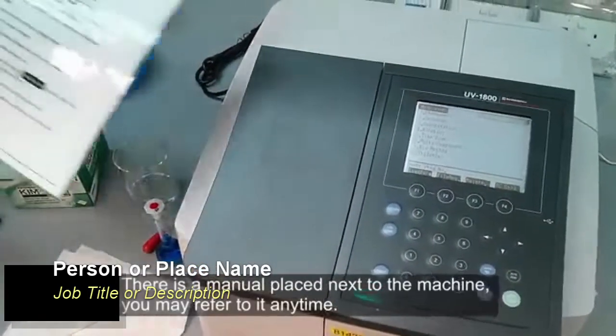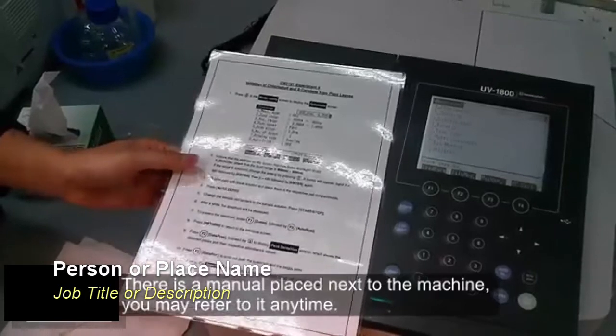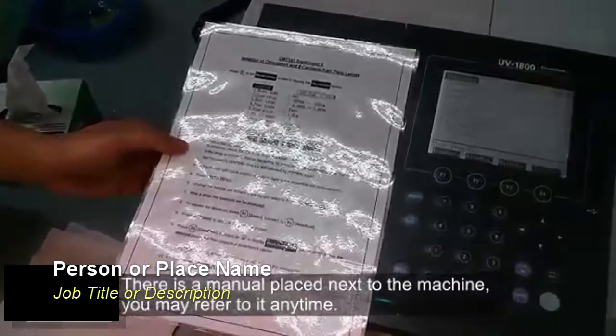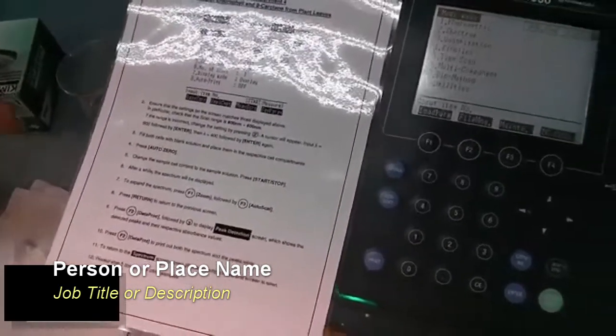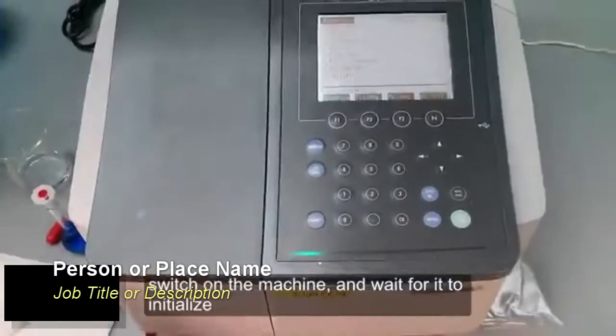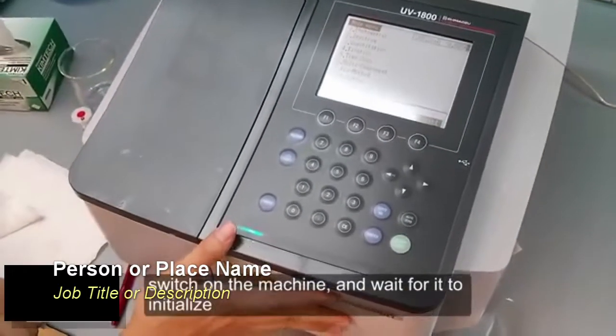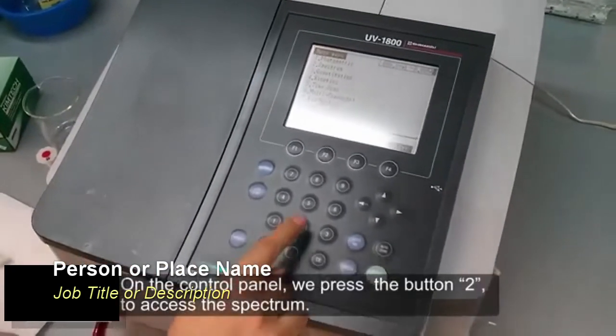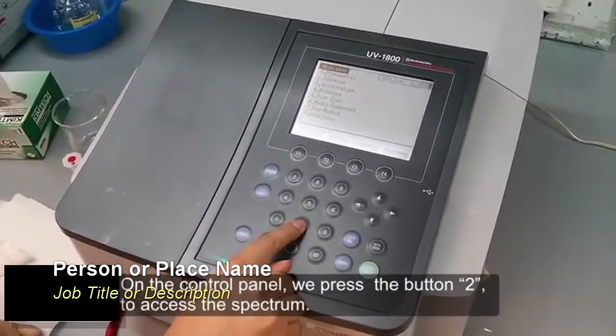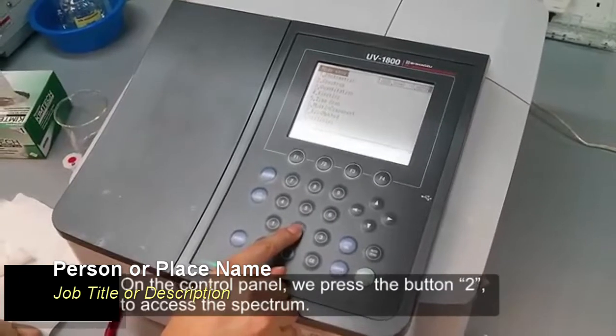There is a manual placed next to the machine. You may refer to it anytime. Turn on the machine and wait for it to initialize. So on the control panel, we press the button 2 to access the spectrum.